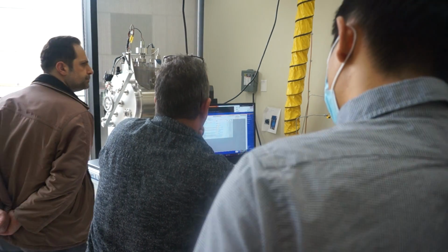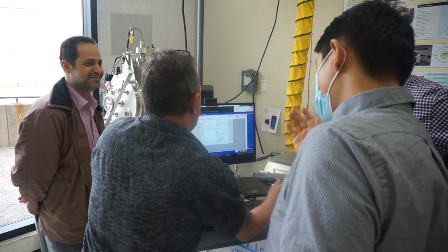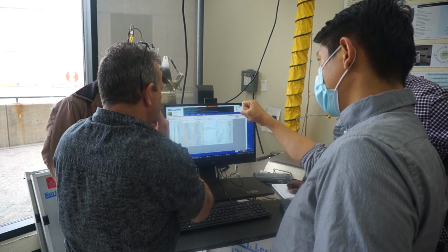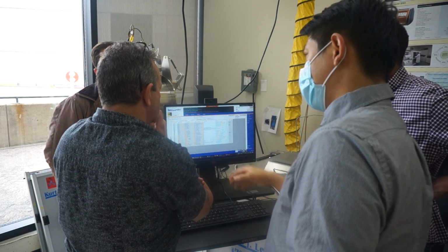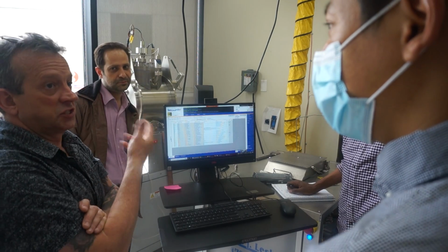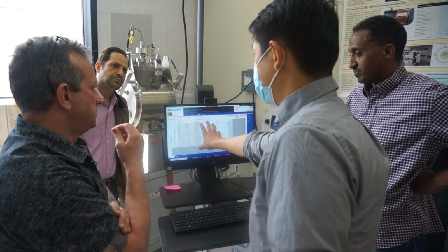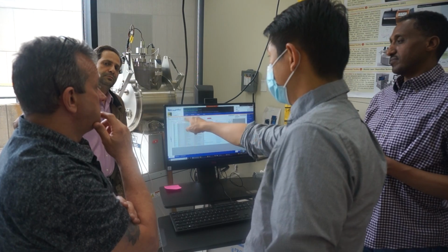So, a question on the recipe. When you talk about different recipes, do you mean you already have something pre-configured like this that you will send to us and we just load? Or is it something we configure and create new? What would be best is for us just to load the recipe, and then you see the difference. Okay. Something like this, but you load into the system. We can just choose from the drop down which one to use.